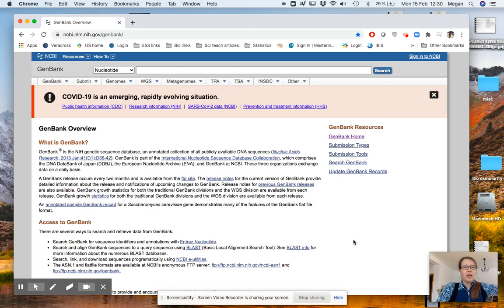Right, we're going to take a look at how we can compare nucleotide sequences between two different species. Now that we know so much about genetics and we run so many different nucleotide sequences in species, we can use these nucleotide sequences to determine how closely related two species are, like when was their most recent common ancestor. So the more nucleotide sequences that they have in common will indicate the more closely related they are.